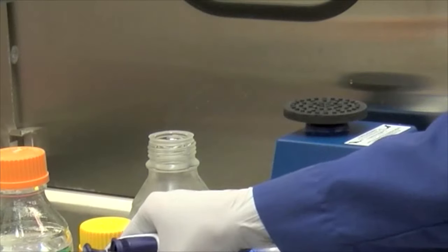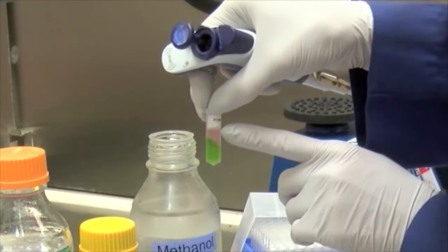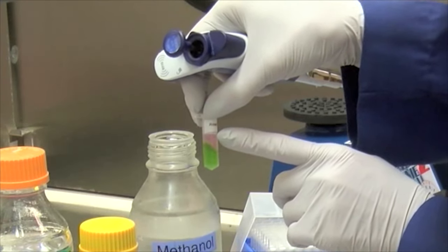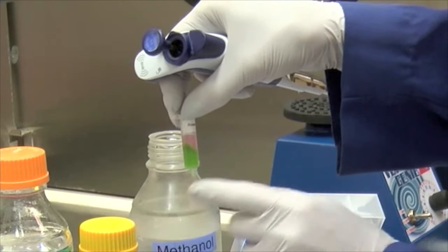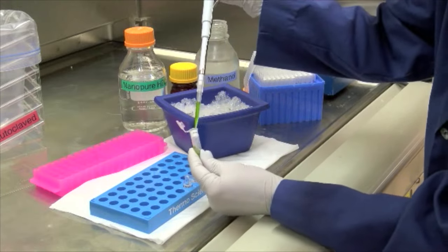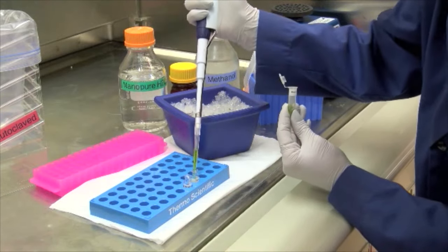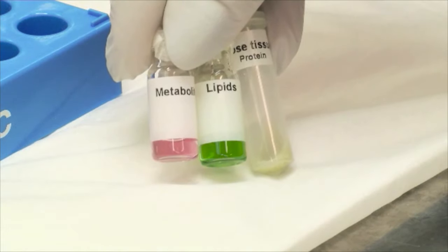So after the centrifugation, you're going to see three phases. So the top layer has the hydrophilic metabolites, while the bottom layer has your lipids. In the middle, it has the protein disks. So now you have it, metabolites, lipids, and proteins extracted from the same sample.